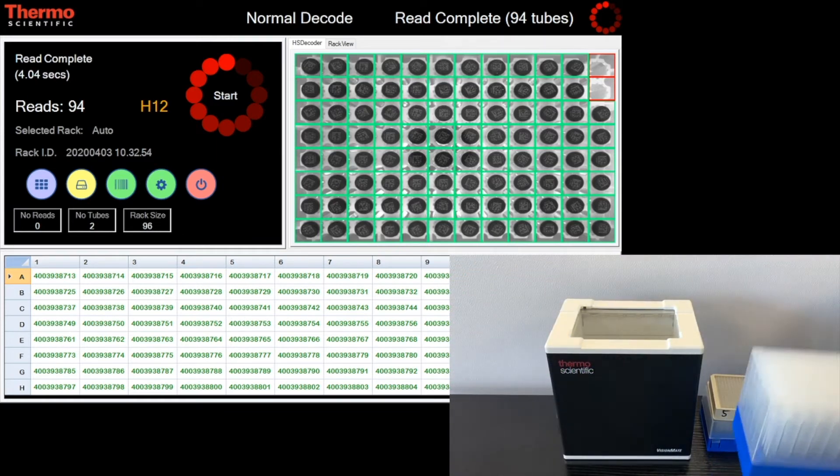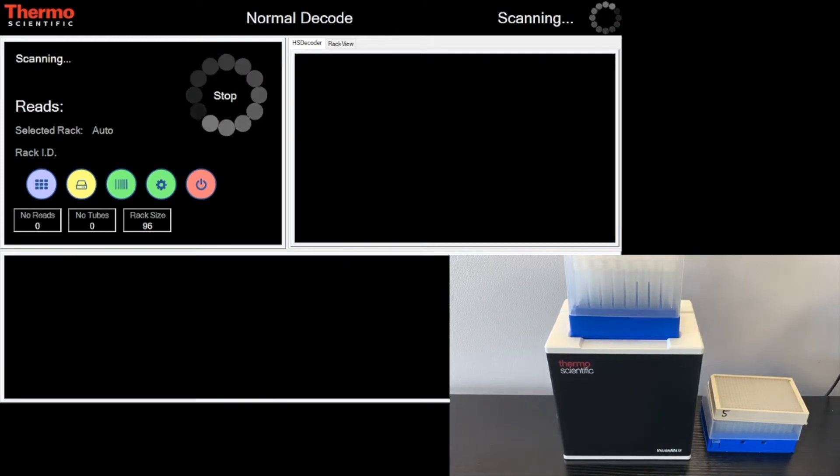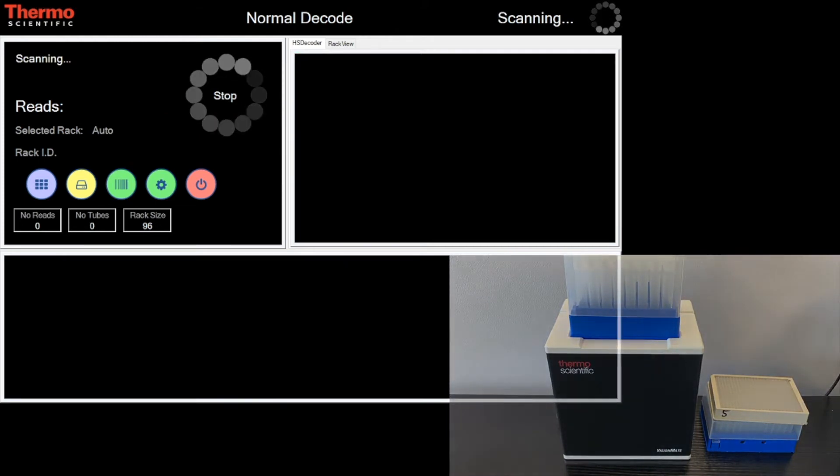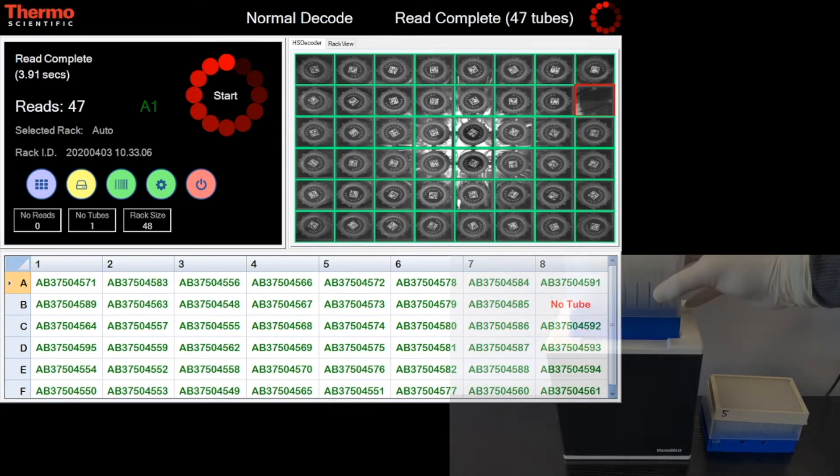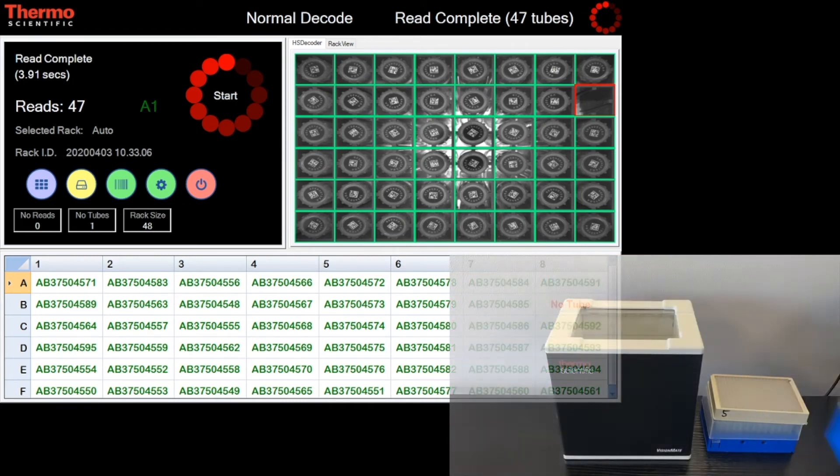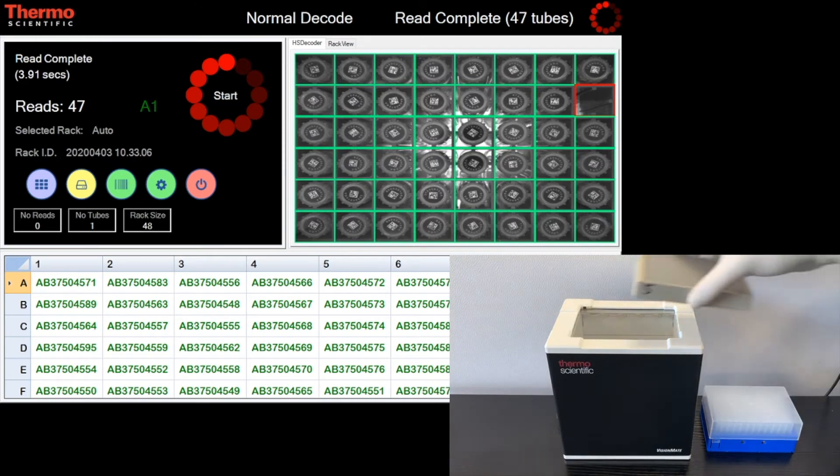The Visionmate has many features to aid the processing of test tube data, such as orientation management, no-read, no-tube detection, and visual aids for the operator.